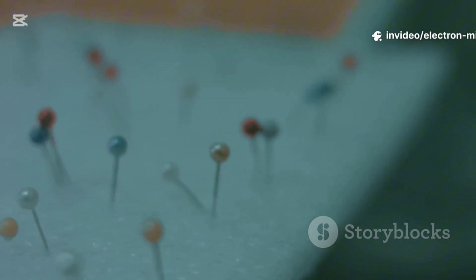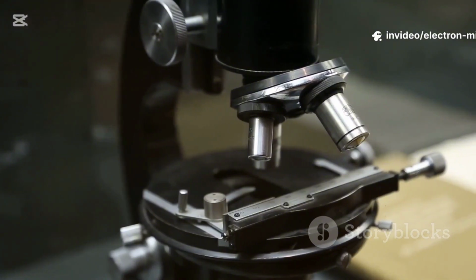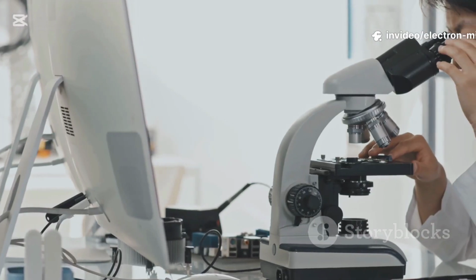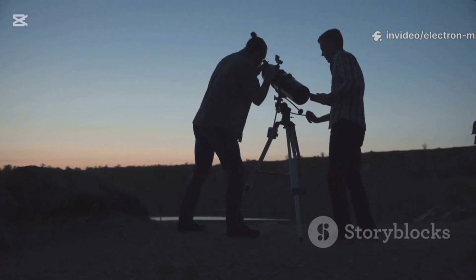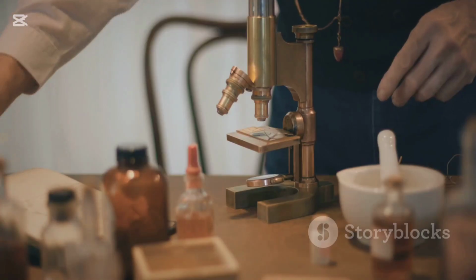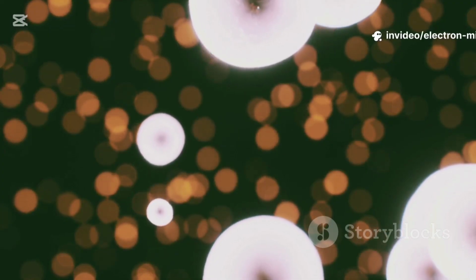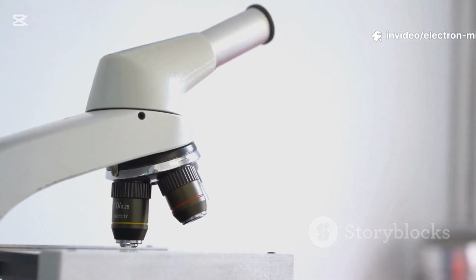Electron microscopes are not all the same. They come in two main flavors, each offering a unique perspective. First, the transmission electron microscope, or TEM. Its key word is transmission. Electrons pass through a thin specimen, sections just tens of nanometers thick, scatter the beam more, forming a shadow-like 2D image of internal structure. TEM reaches the highest resolutions, down to atomic lattices and viral machinery at work. The trade-off is intense, often destructive sample preparation.